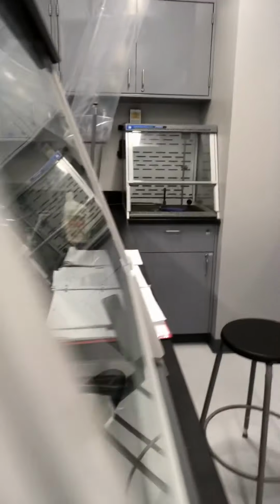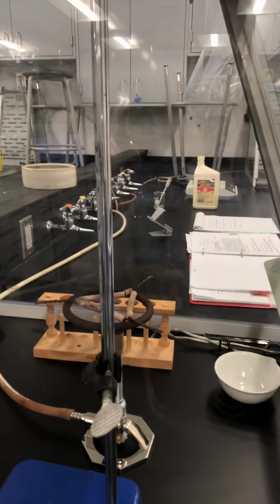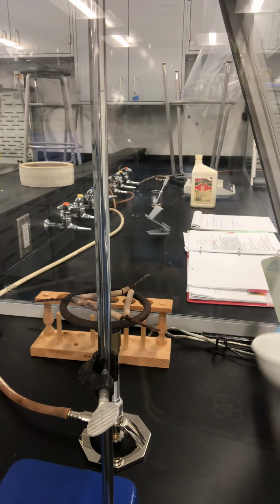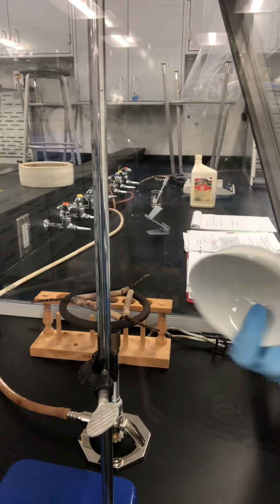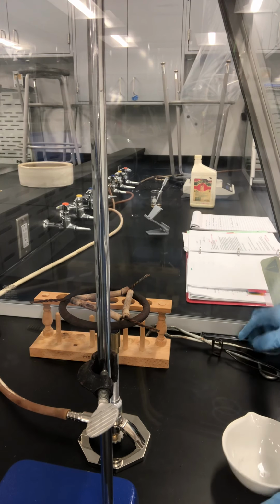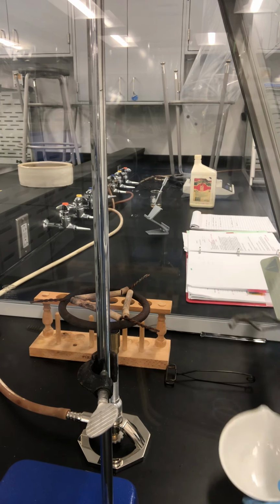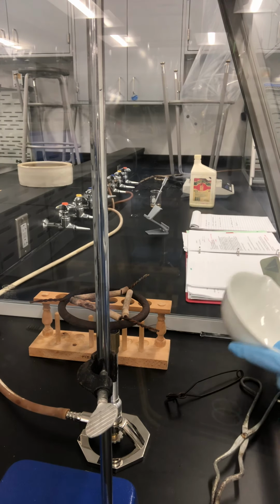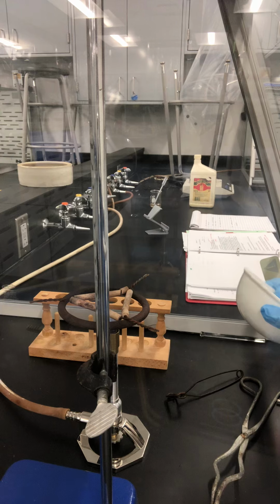Let me put this here. Okay, perfect. And we're gonna use the evaporating dish. Step 1, you need to wash it, make sure it's clean. And I already washed it with soap and water.